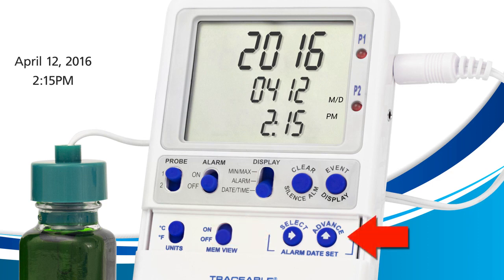If we press Advance, the time format will change to a 24-hour military time format. Press the Advance button until you have the format you prefer. Once you have the format you prefer, press Select and this will exit time setting mode.